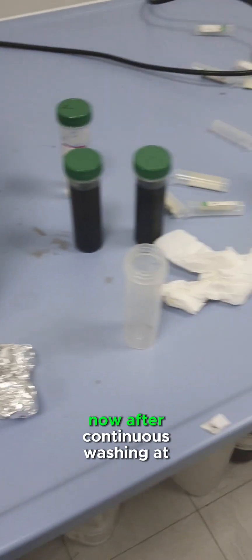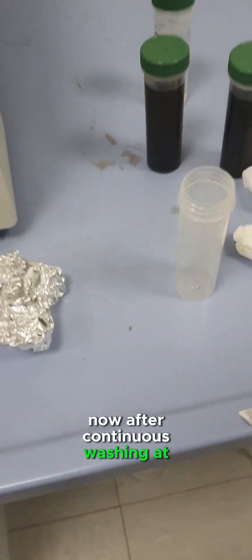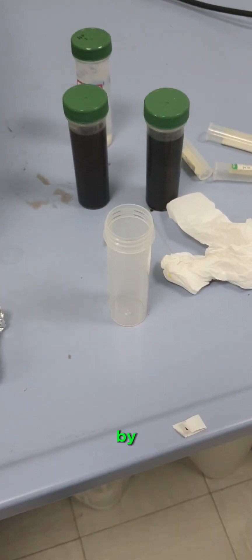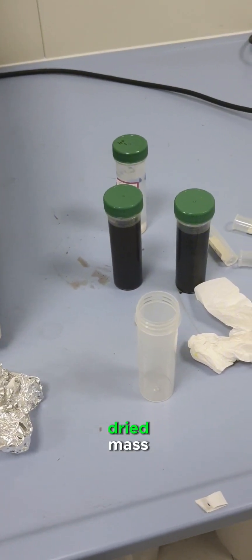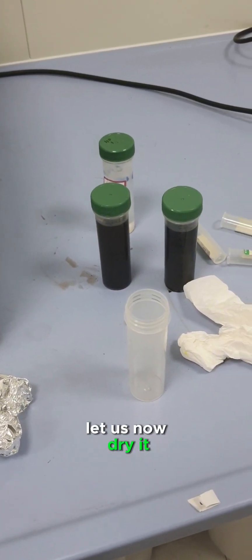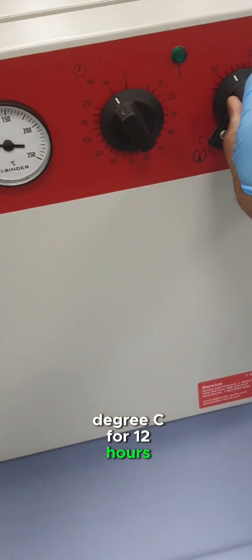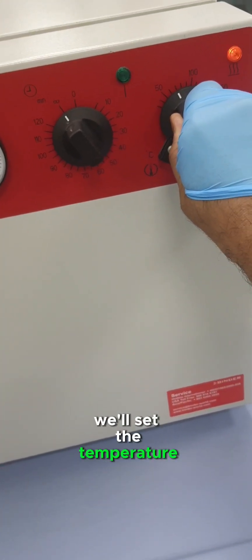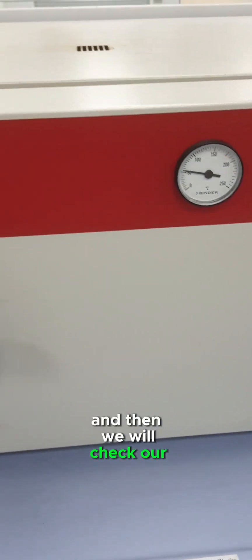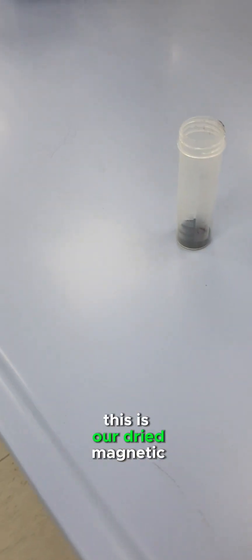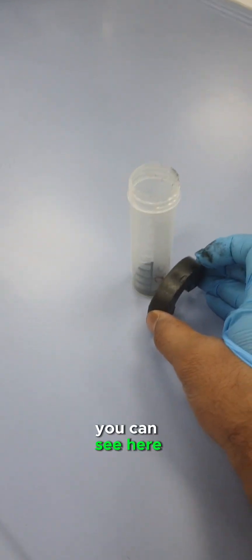After constant continuous washing, at the end we'll wash with acetone and then we will see the dried mass. Let us now dry this. I'll dry this at 70 degrees Celsius for 12 hours. We'll set the temperature and then we will check our magnetic nanoparticles. This is our dried magnetic nanoparticles you can see here.